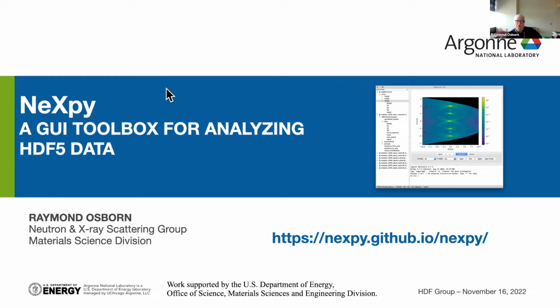I should introduce myself. Sorry, I'm Osborn. I'm a scientist at Argonne National Lab, so I'm not a computer programmer, although I do quite a bit of Python programming mostly now. My background is mostly in neutron and X-ray scattering. And in recent years, we've been collecting larger and larger volumes of data, and we've needed to develop the tools that allow us to cope with this torrent.